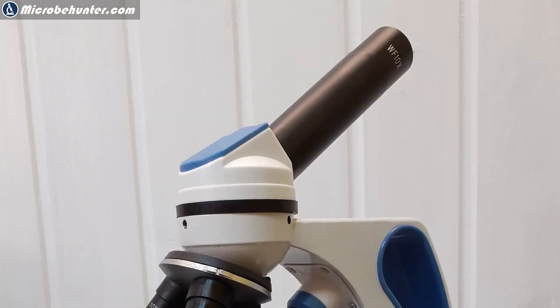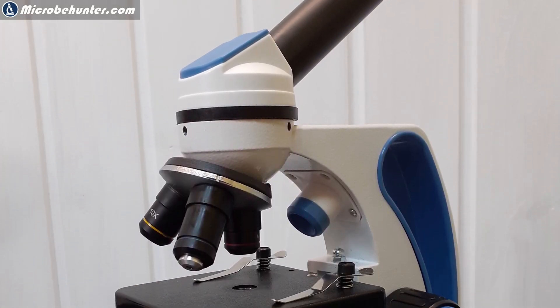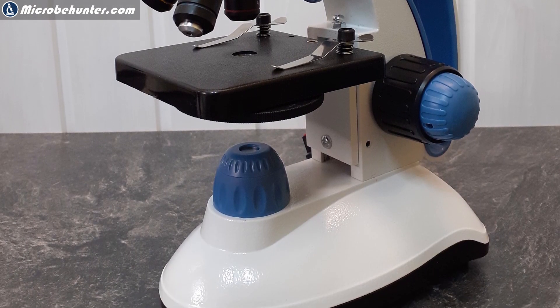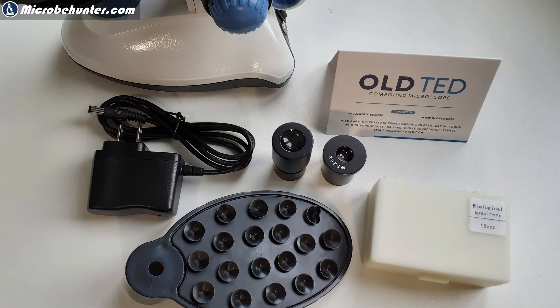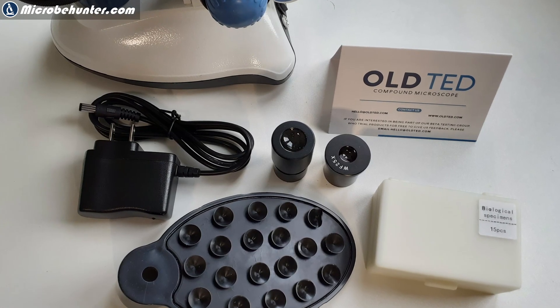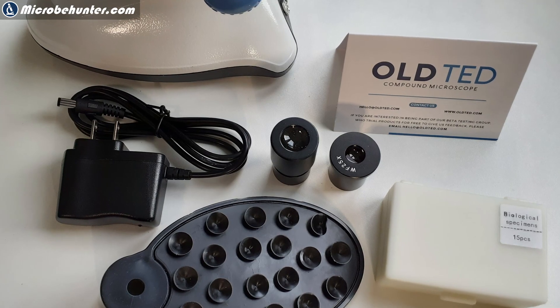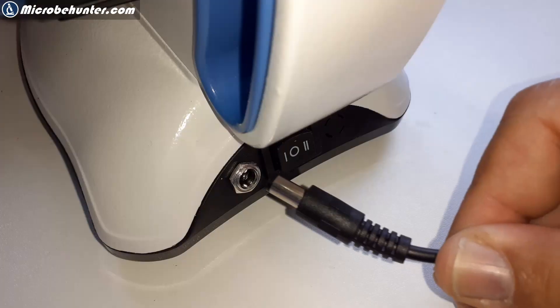The microscope is made mostly of metal. Of course, there are a few plastic parts. And I think it's a good microscope for children, but also for those people who really do not want to spend a lot of money and who would like to get a first taste of microscopy.